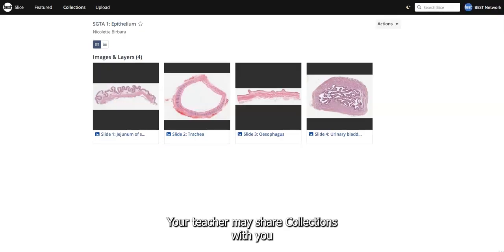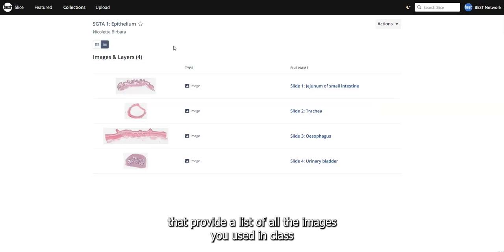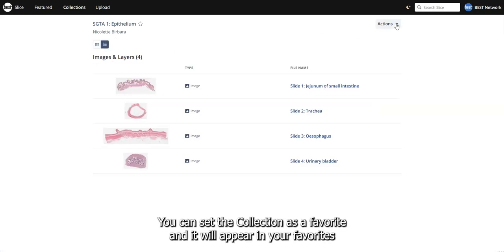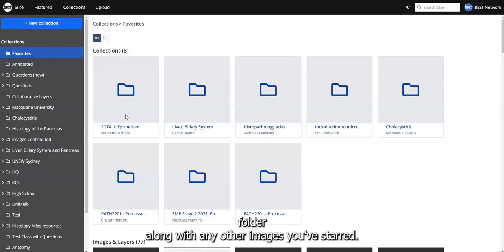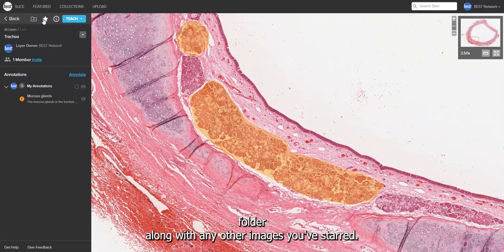Your teacher may share collections with you that provide a list of all the images you used in class. To make it easier to find these for revision, you can set the collection as a favourite and it will appear in your favourites folder along with any other images you've starred.